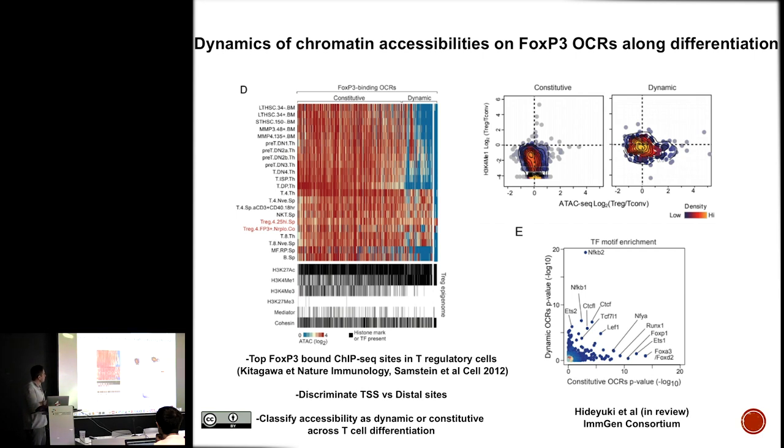So we computed the differences across the differentiation, plotted like a generalized linear model, from stem cells all the way through T cells, to then ask if those dynamics were significant when compared to the dynamics in the constituent. Am I answering your question?